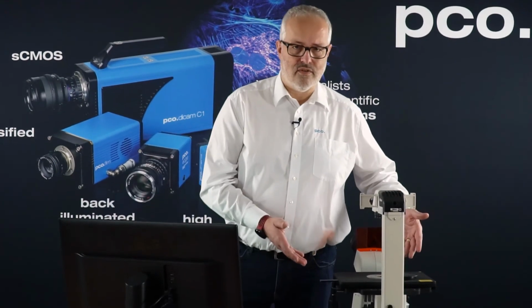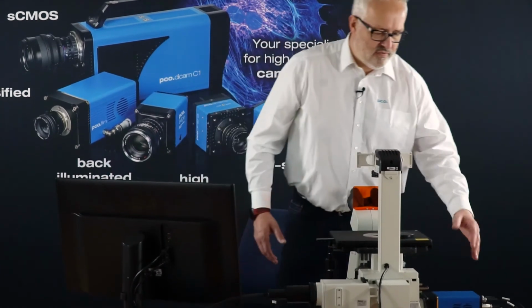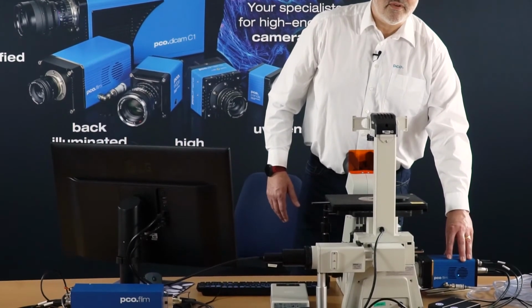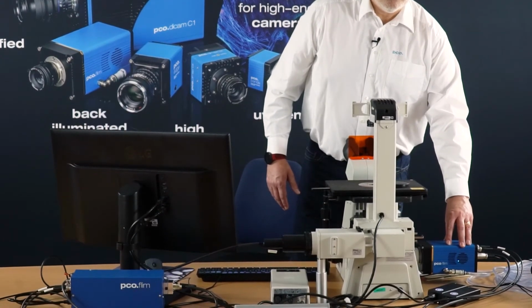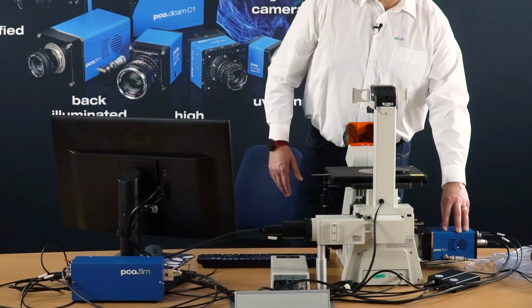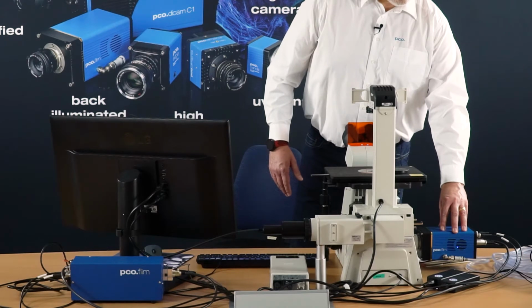Like for usual fluorescence measurement, we have a fluorescence microscope, in this case an inverse one, to which our camera system, the PCO FLIM, is connected. You see it here. The very convenient thing of the PCO FLIM is that all the modulation and frequency signals that are necessary are generated within the camera, so you don't need any extra instrument. At the moment, it's additionally water-cooled, but this is only required if the ambient temperature is above 25 degrees. In our situation here, it just makes the job for the inbuilt fan a little bit easier.